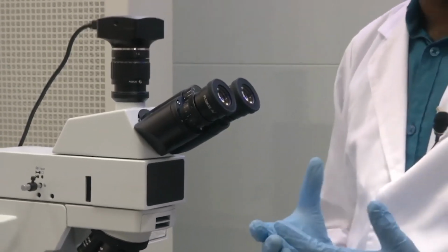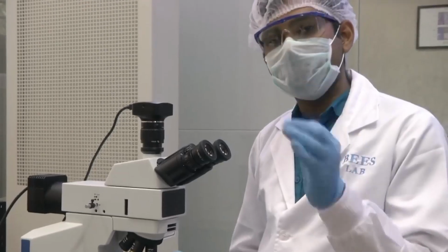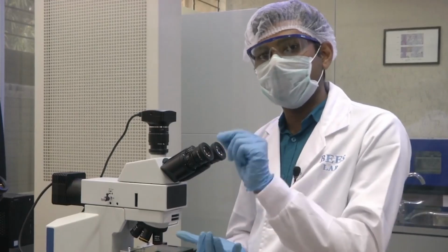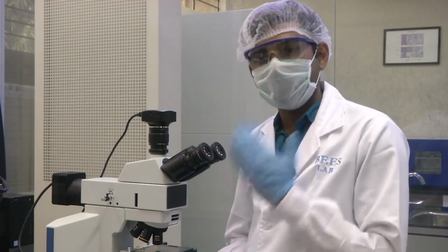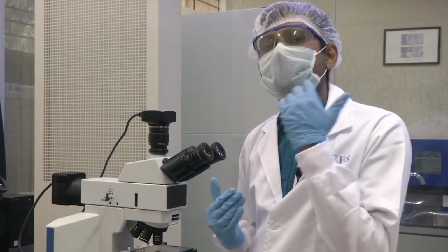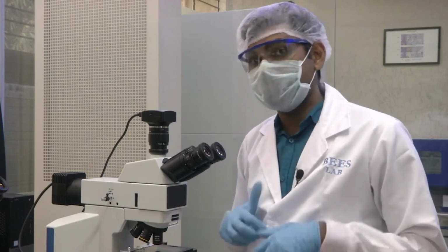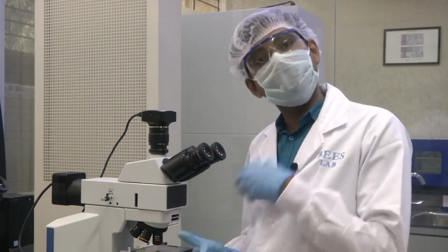What happens in that? Let us say we have a sample and we add a particular chemical to the sample. What that chemical does is, it goes and interacts with some particular feature of that sample in such a way that after interacting, that particular sub feature of the sample emits a particular light. So, it starts emitting light. What is fluorescence? Fluorescence is when a substance starts emitting light. So, when it emits light, we can capture that.